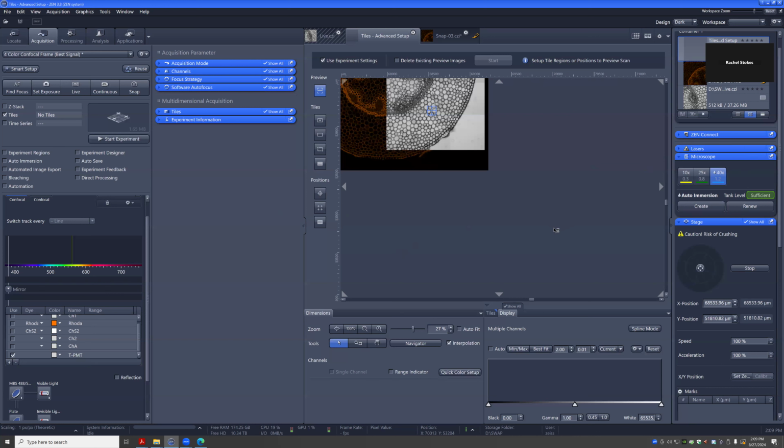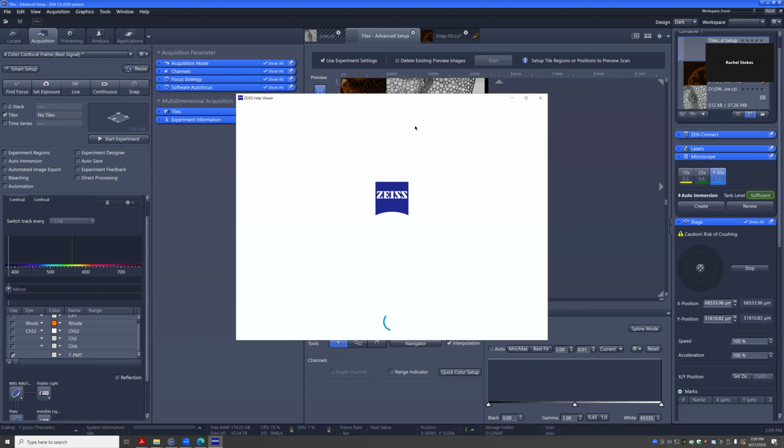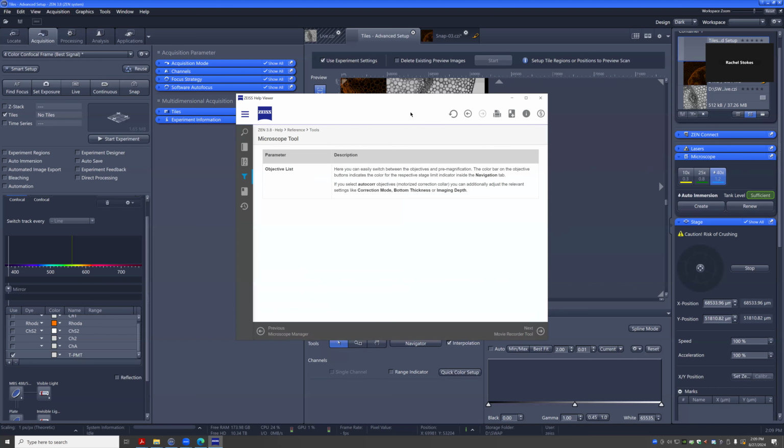Let's see if they have it listed here, but it's basically microliters, right? Yeah, it's just a small amount. I saw the amount that you put out the first time, and then you did it again, so you put double. Yeah, and that's 2 times create. That's a fairly large drop. It is.